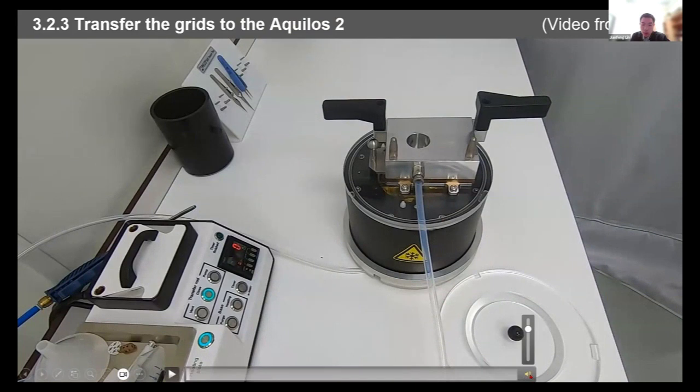So this movie is a show, I will turn off the sound. This movie was recorded by my previous colleague in the Czech Republic, in the factory of the Aquilos 2. It records the details of the transfer process.